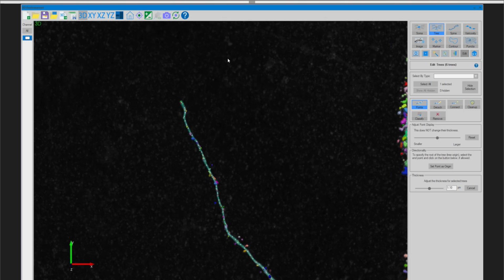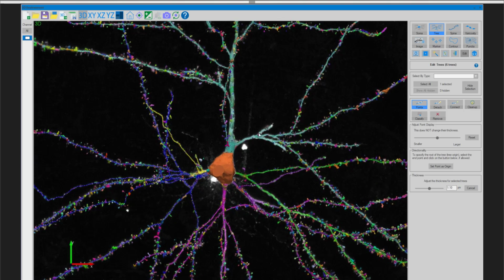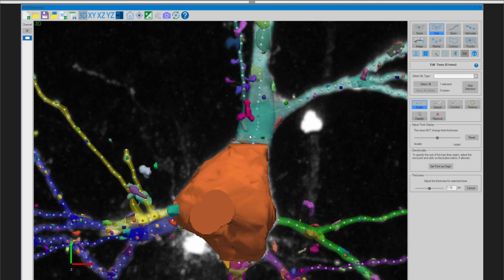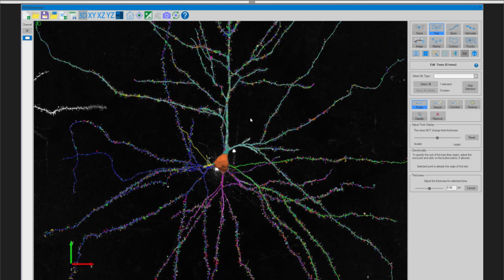And if they're not connected, naturally they aren't in the program, that's where things can get a little hairy and a little bit confusing. So it's always recommended, after you're done your tracing, to go through and make sure that, one, the origin points are in the right place, and two, that if they are in the wrong place, they're switched over to the proper location.